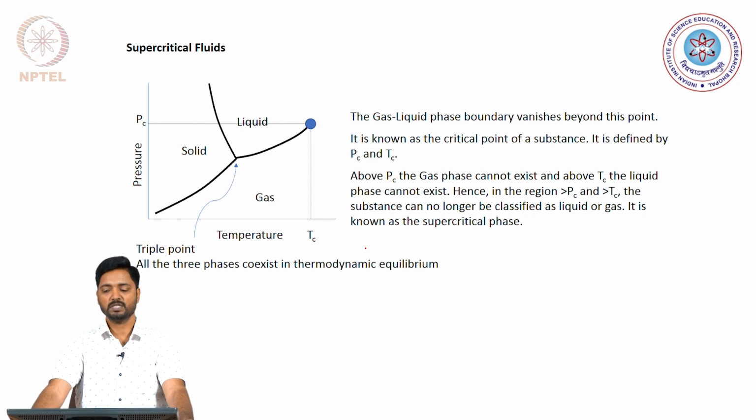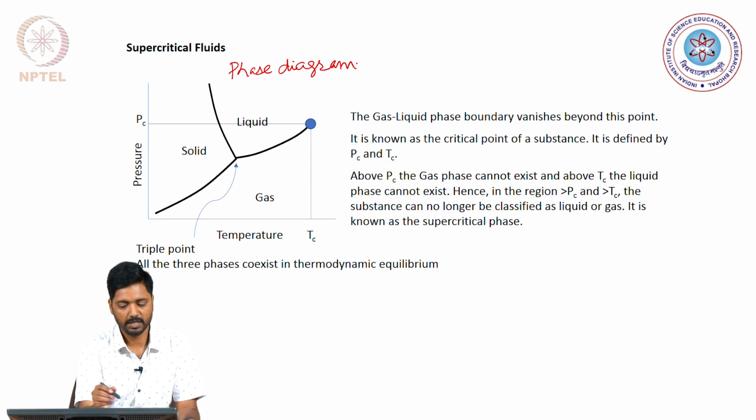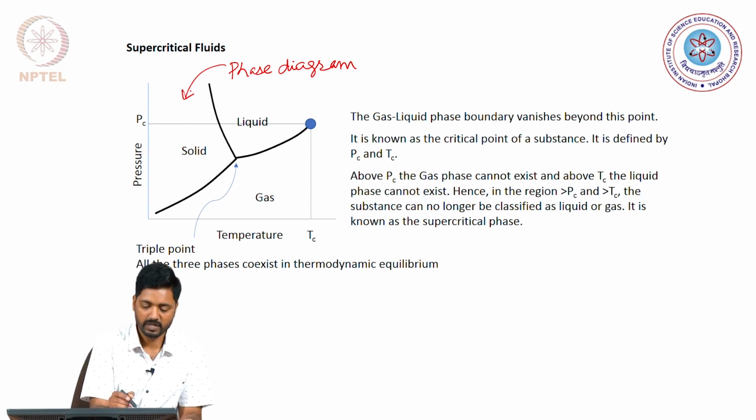So, let us first get ourselves introduced to what we mean by supercritical fluids. This is a very interesting concept, in that when we make a phase diagram, which is shown here, we can segregate any substance into the phases that it will take.